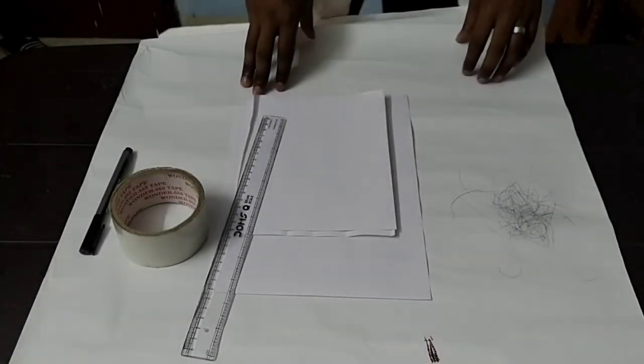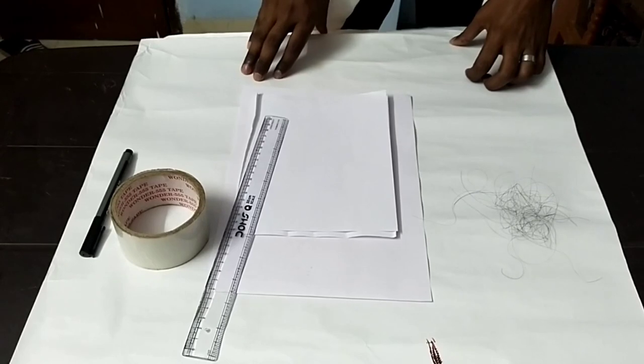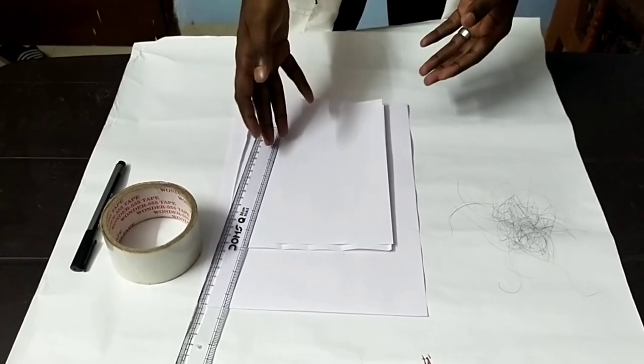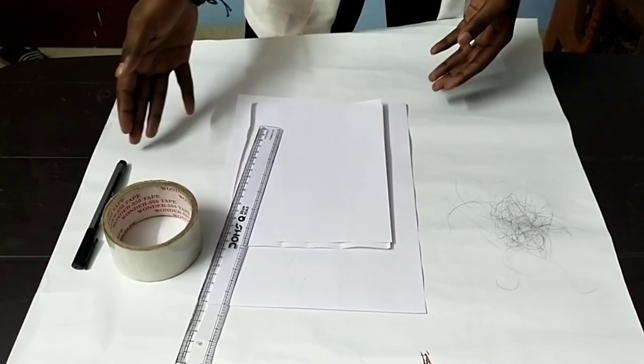Now let's see the requirements for the druggist fold practical. I will utilize the following items for conducting this experiment: the hair sample, paper, ruler, cellophane tape, and a marker.